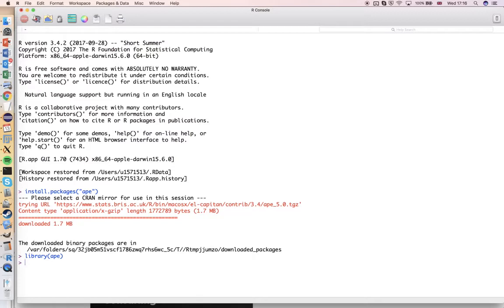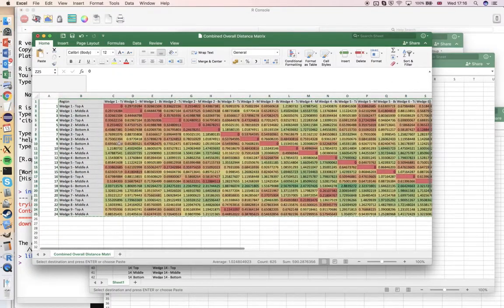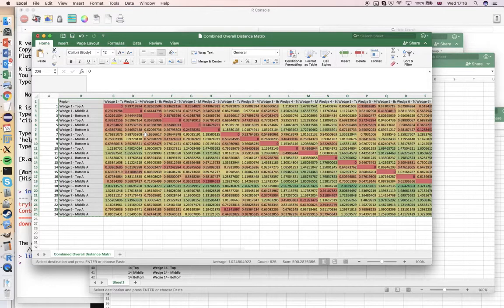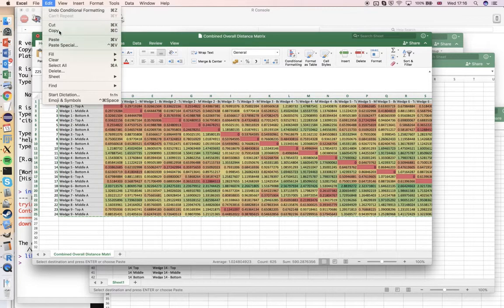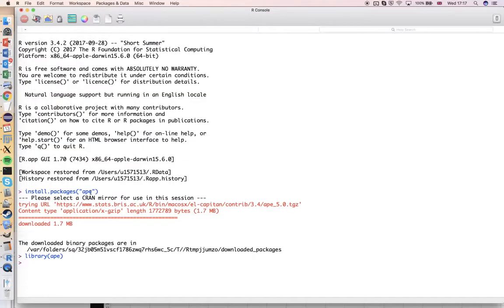Okay, now we need to get our table. You can do various things for opening files, but it's different commands depending on whether you have a text table or an Excel table, and Excel is sometimes hard to do. Either way, we'll just do copy paste. So I've selected that, and I'm going to go Edit, Copy. Now the general command for how to bring it into a table in here is the same, but it'll be slightly different on Windows and Mac.